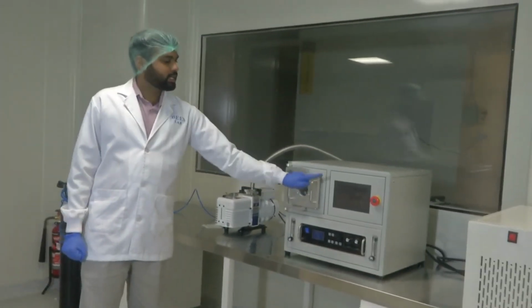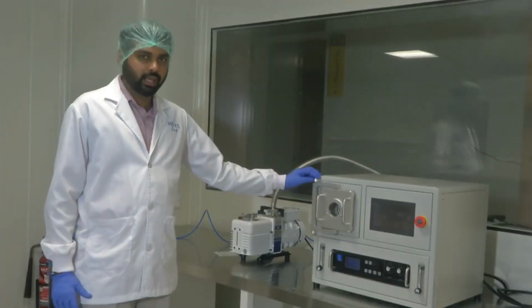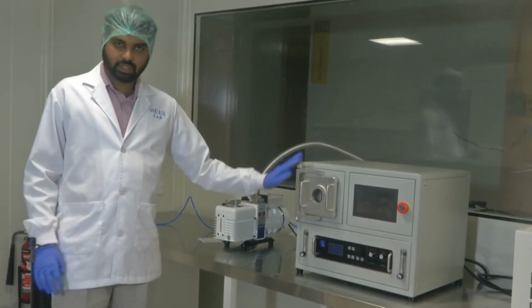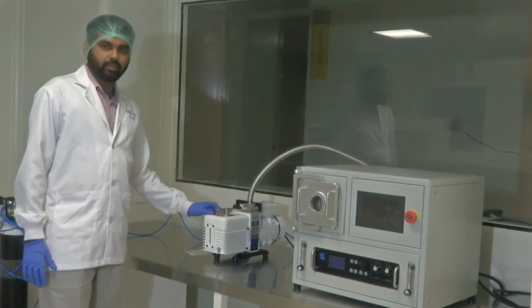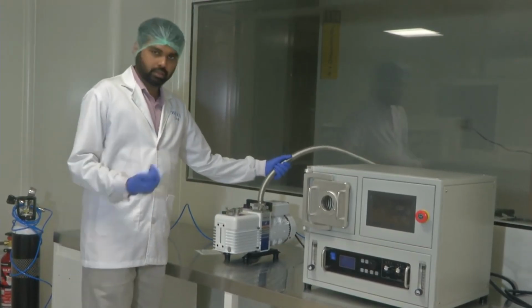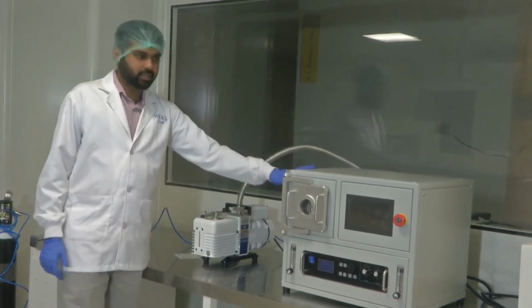I will get into details of each of these interfaces soon. So we have the main system here. I will go into details about each of the subparts of the system later. To this system is connected the vacuum pump. This is an oil based vacuum pump. It's a rotary pump, and the pump tube from which the air is sucked out is this. It is connected to the main system.